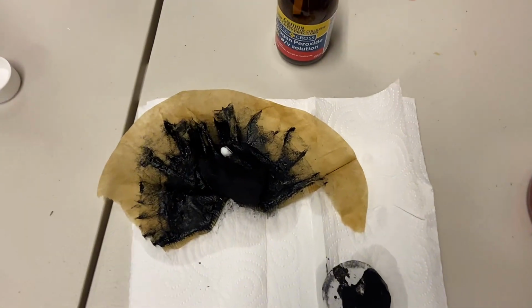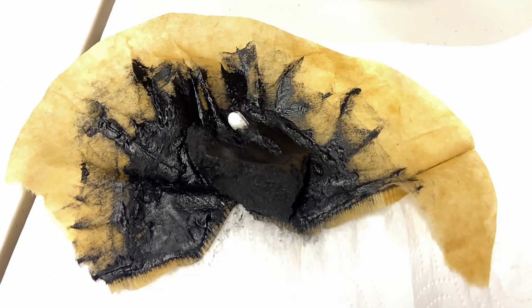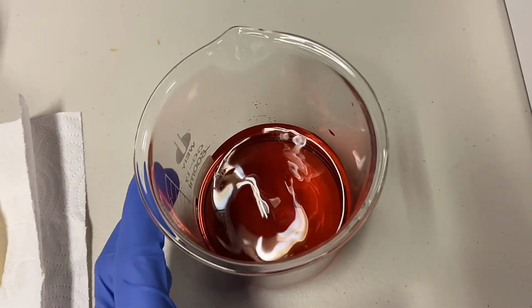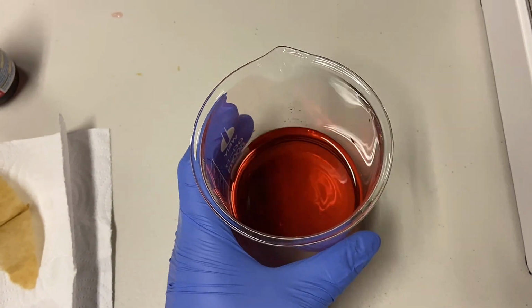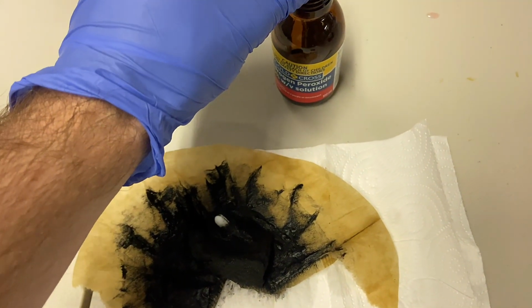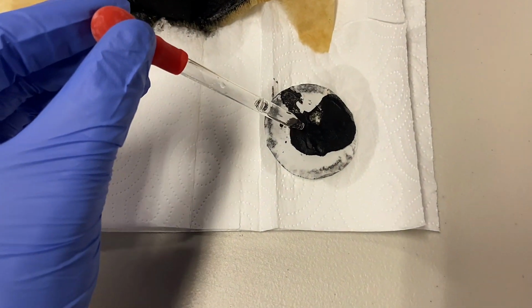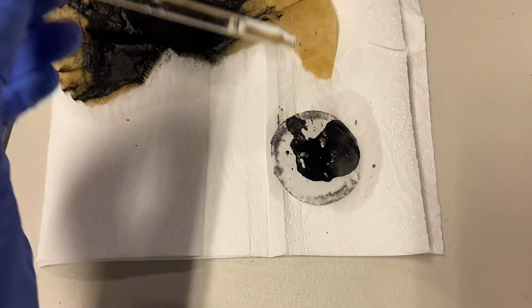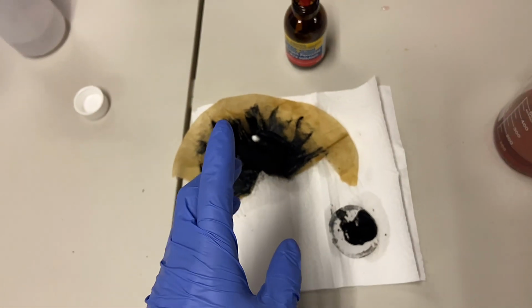And there we have it. That is manganese dioxide. Got quite a lot from these vape batteries, so I'd assume that they are pretty manganese heavy. And then here is the solution now that everything's filtered. As you can see, it's gone back to the original color, which is exactly what you want. And just to prove that it is in fact manganese dioxide, I've got a little bit of hydrogen peroxide here. Don't need much. And on this little piece of filter paper, if I just drop some, you can see there that it fizzes up.